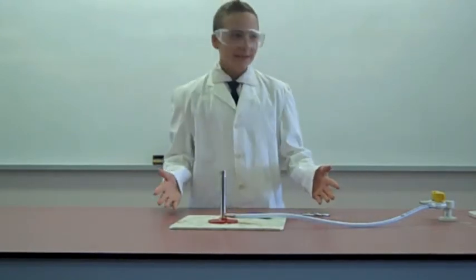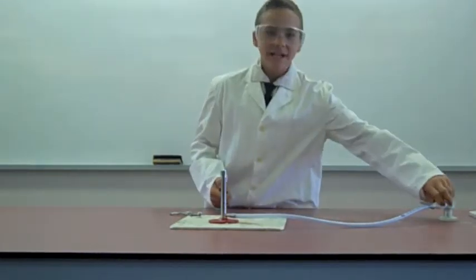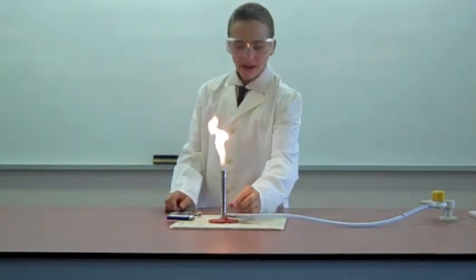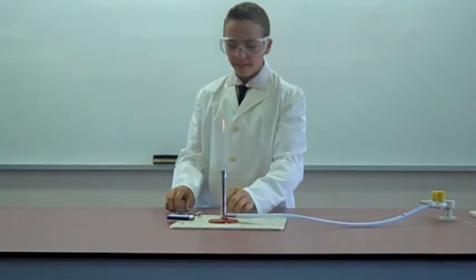All right, let's begin. First step is to turn on the gas and hold your match or lighter near the Bunsen burner. After this, adjust it so the flame is safe.